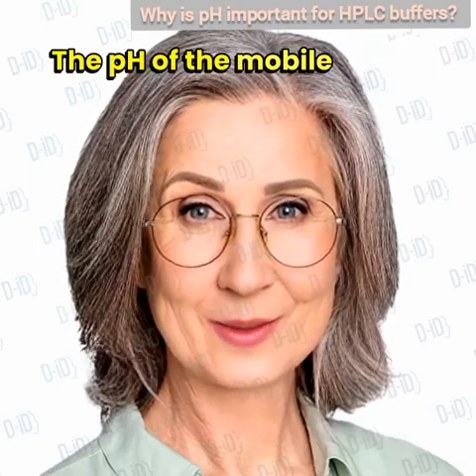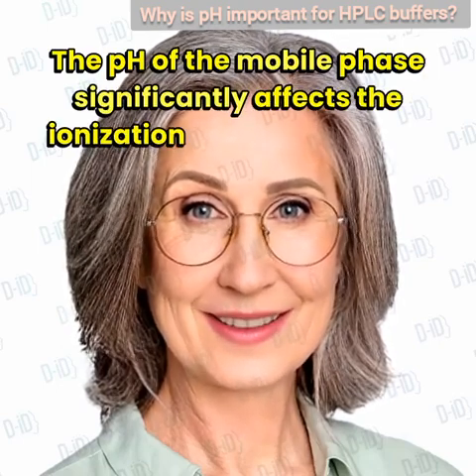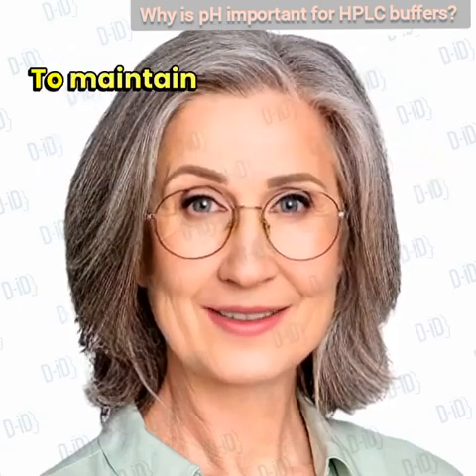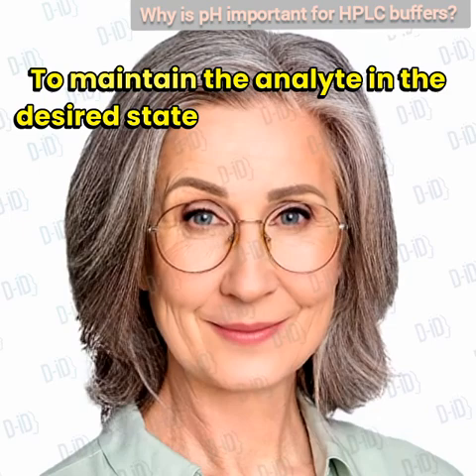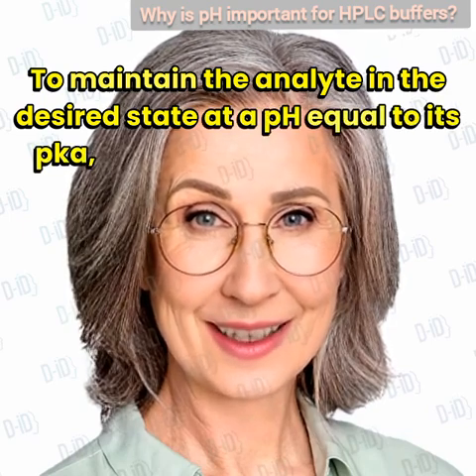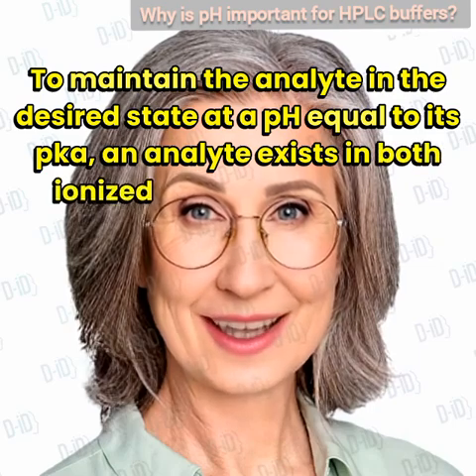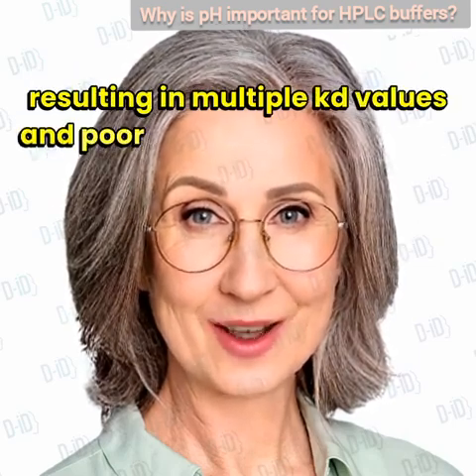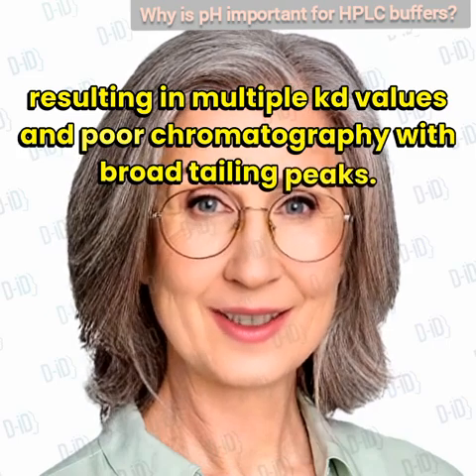The pH of the mobile phase significantly affects the ionization state of ionizable analytes, necessitating buffer usage to maintain the analyte in the desired state. At a pH equal to its pKa, an analyte exists in both ionized and neutral states, resulting in multiple Kd values and poor chromatography with broad, tailing peaks.